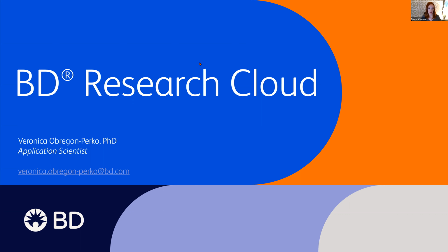We're going to be talking about the BD Research Cloud today, one of our newest platforms from the informatics team at BD. And as we're going to learn today, it's going to be a complete ecosystem to help support your flow cytometry studies. So I'm going to open with just one or two slides talking about what we're going to show in today's demo. And I'll also share some learning resources where you can learn more about the platform or refresh your learning after the webinar if something's not clear.